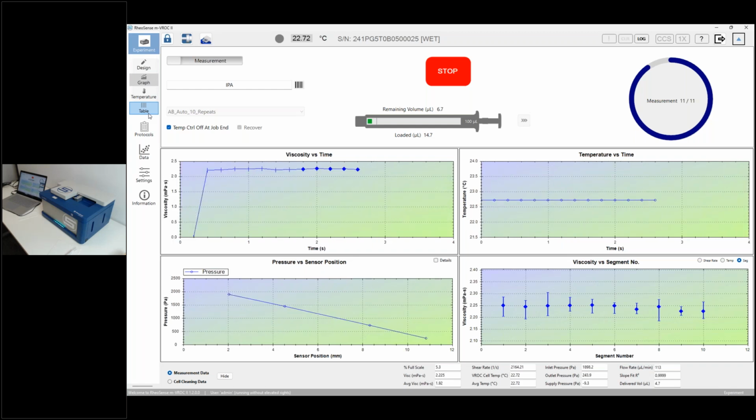Some of our clients that have adapted to the VROC II find that recovery is very helpful, particularly when looking at stability. You could do a lot of this work early on that maybe was pushed off later downstream because of volume restrictions. But now we're finding that doing this much earlier on can streamline your process and even possibly get your drug out to market faster, saving you a lot of time, energy, and money.